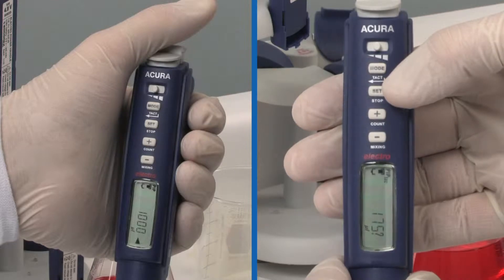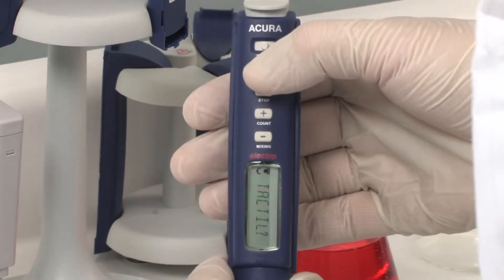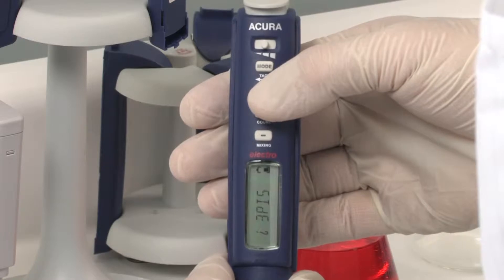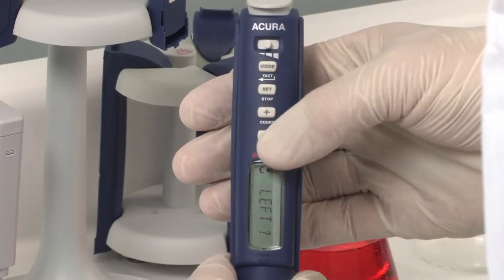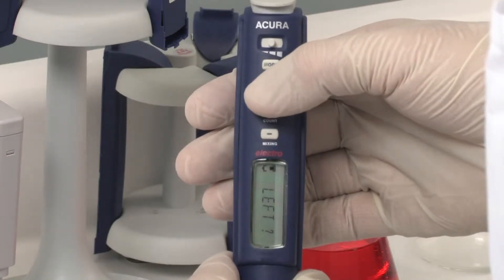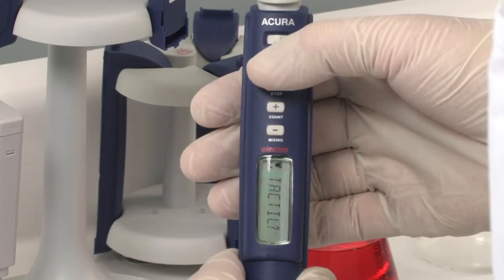The display can be changed to accommodate right or left side reading. To change the side, press mode for two seconds and select side. Confirm by pressing set, and use the plus/minus keys to change. Press set again to confirm your choice and press mode for two seconds to return to the pipetting menu.